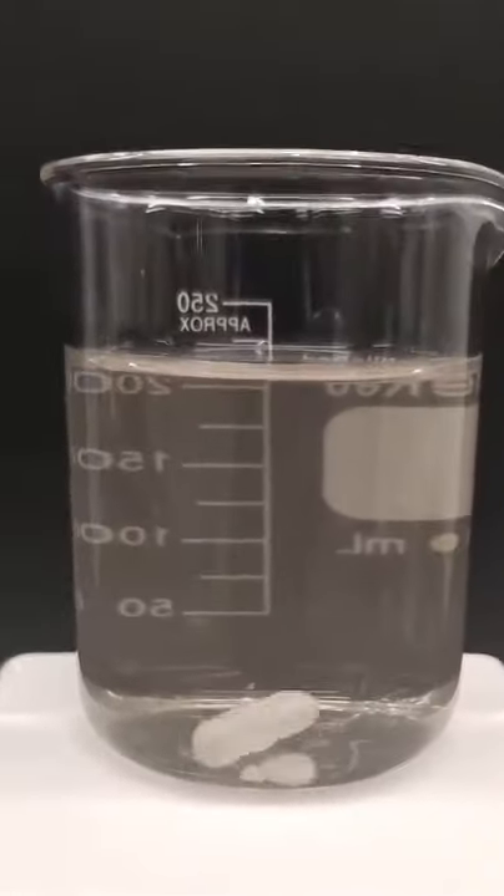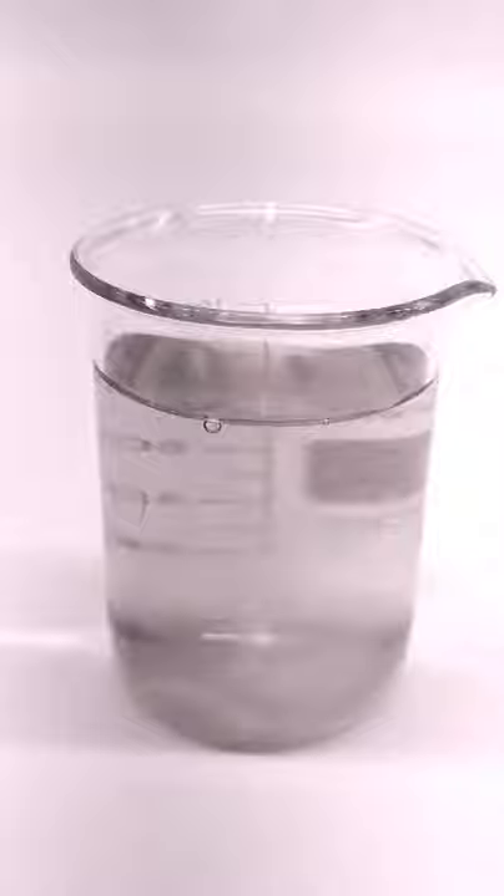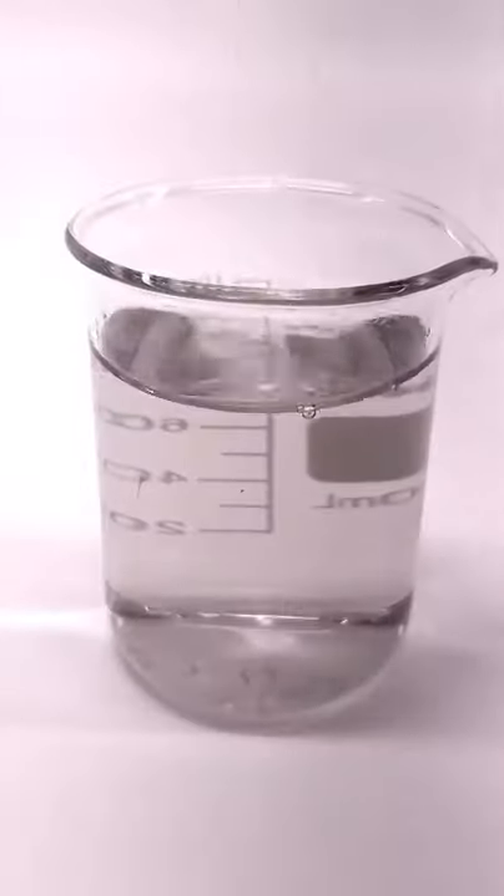The solution's ready, but I only need 100 mils, so I'm going to pour it into another beaker. To get the reaction started, I have to add some glucose, and I can now pour it onto the dish.